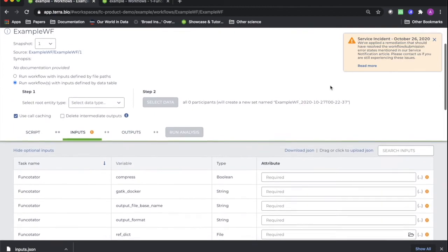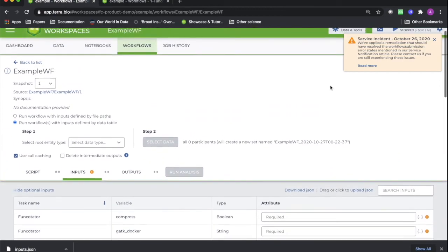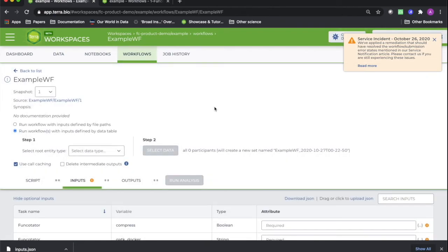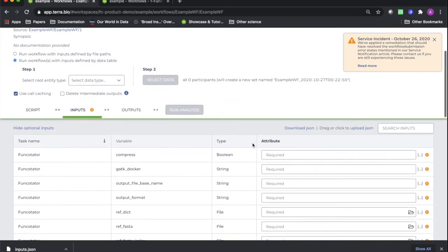If you click on the card for your new workflow, you can see the configuration of the inputs and outputs in the lower part of the screen. Note that the fields are all blank because we selected Use Blank Configuration.